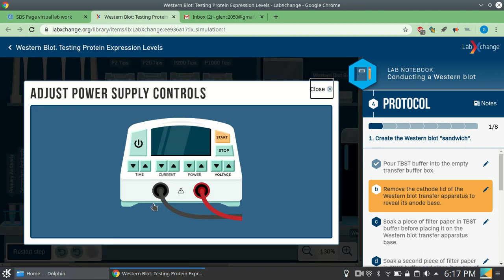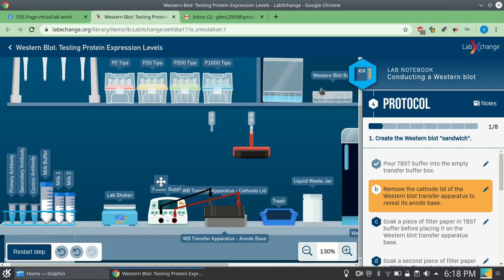And then I have another hint for you. When you try to turn this on, you're going to have to change the voltage like that. And then you're going to have to go to 150. You're going to have to change the time. Now, this timer here is very hard to see because it's small. We're looking at these numbers right there. That's what you have to be changing, all right? Then you will do the start. And just like last time, the time goes down real fast, okay?